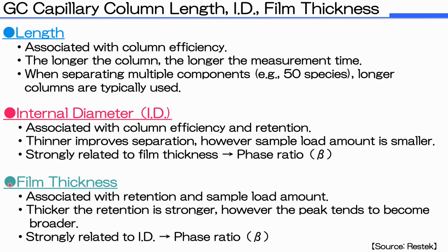And next, film thickness. This is associated with retention and sample load amount. The thicker the film, the stronger the retention. However, the peak tends to become broader.